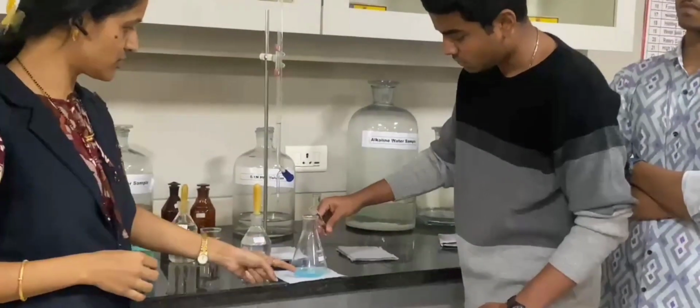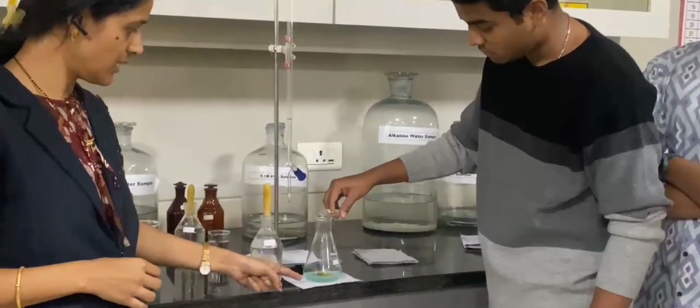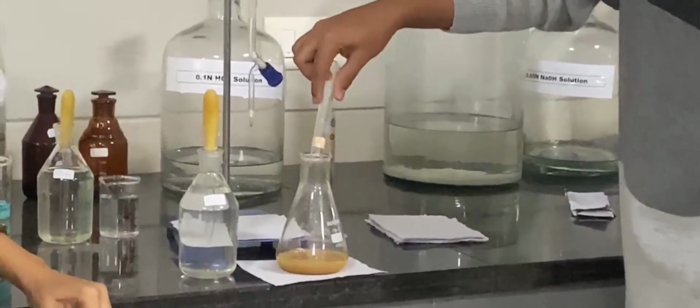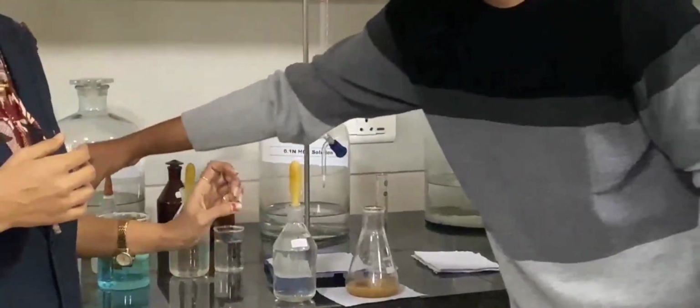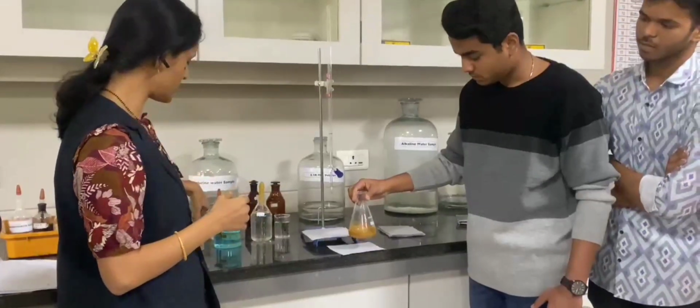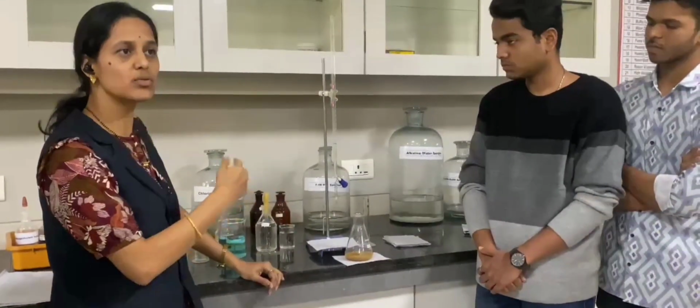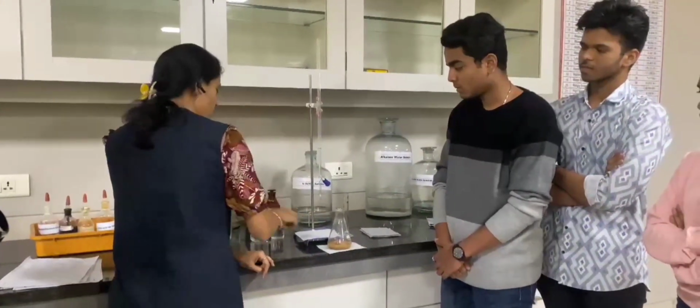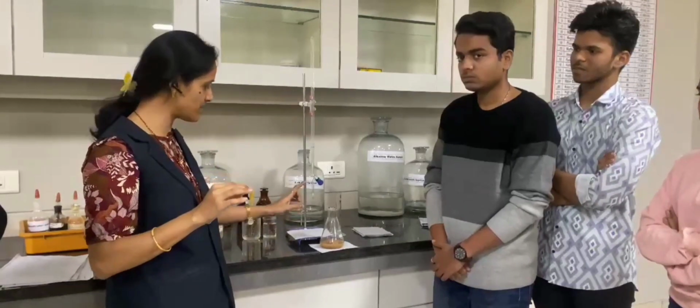Whatever CuSO4 is present in the solution will react with the KI solution and form I2. So you can see the stock solution turns brown. And what is our end point? Brown to milky white. This is called iodometric titration, which means that by using iodometric titration we can estimate the copper from the brass solution.